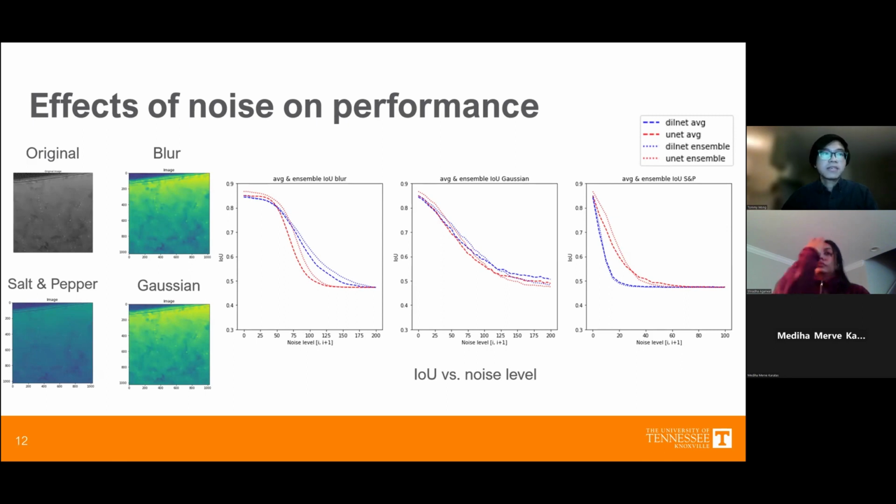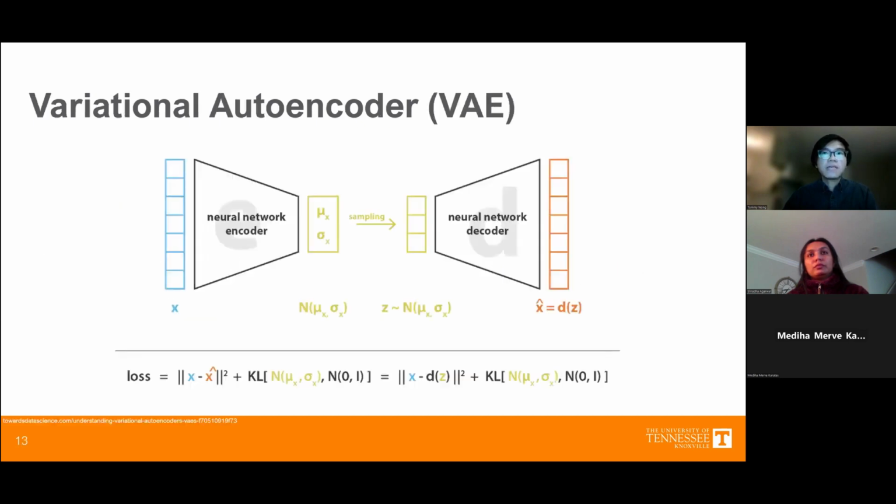Because while for small regions, when noise is applied to the image, it renders it incomprehensible for both the network and frankly for the human eye. But if more big picture information is preserved, so that the network could examine the entire image better, then it enhances the accuracy, or rather it lowers the drop in accuracy because of noise in the data.